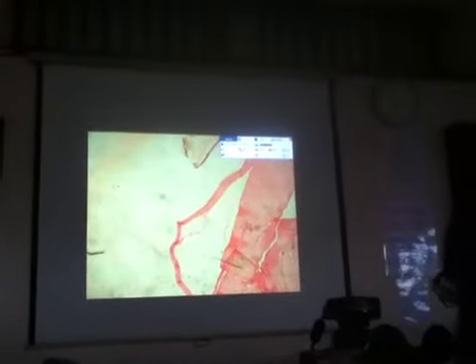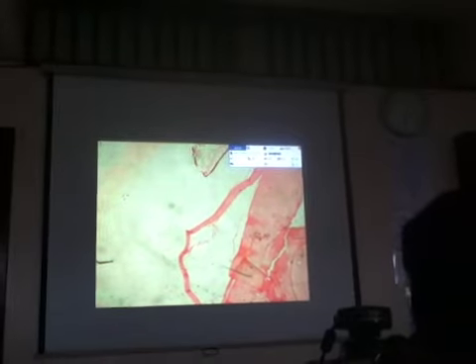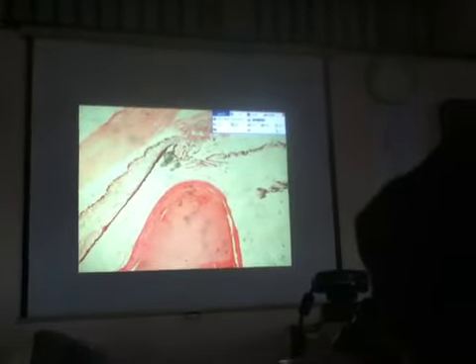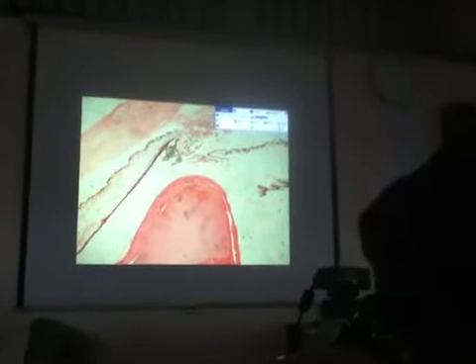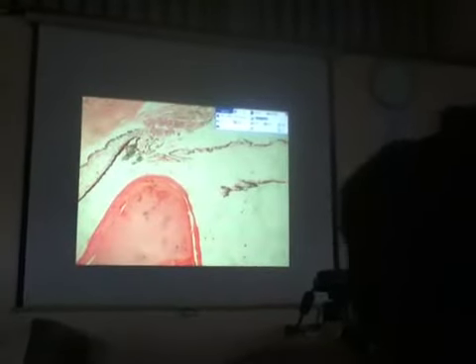Now, the iris is actually like a hollow circle. There is a hole at the middle. So that should serve as the superior margin of the hole and then the inferior margin of the hole. How will you call the opening in the iris? The pupil. Good. And then the lens is kept in place by those fibers which are called zonular fibers, the zonular fibers or the lens fibers.